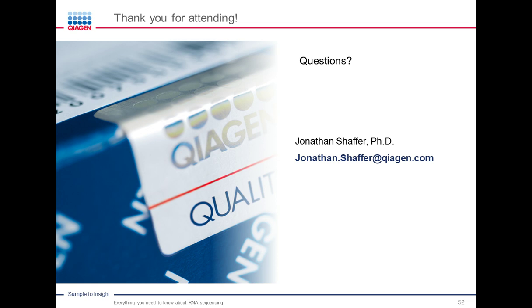Our first question is, when performing transcriptome sequencing, do you recommend mRNA enrichment or ribosomal depletion? That's a great question, Judy. So it comes down to what you're interested in. If you're interested in mRNAs only, I would recommend mRNA enrichment. So basically select for your RNAs that have a polyadenylated site.